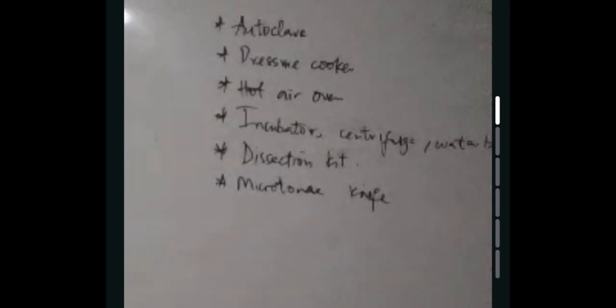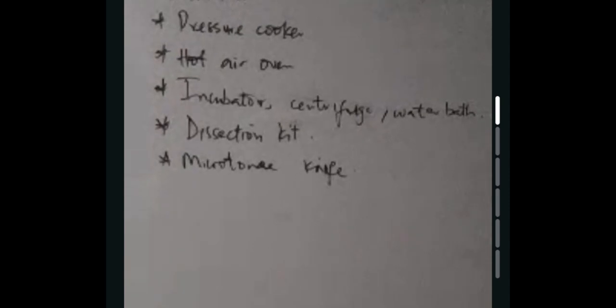Microtome. Is it microtome? Okay. So the autoclave, this is one of the complex ones. It's not just one simple thing as in a chemistry lab. It's equipment also used in the biology laboratory. It also provides heat, very high temperature, and they use it in sterilization.